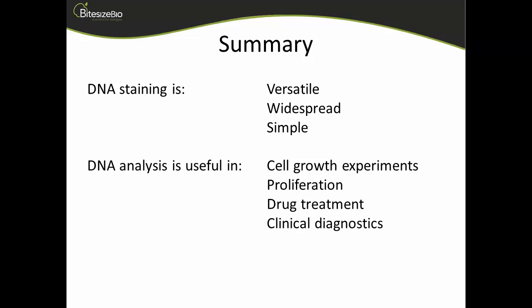You spoke about saturating concentrations of dyes. Do you find this is common to most cell types when they're fixed, or is there a lot of variation between different cell types? If you always stick to the same cell concentration when you're dealing with mammalian cells, there's not a lot of variability. But of course, stoichiometry depends not only on dye concentration, but cell concentration as well. So if you've done your titration and worked out that you saturate at a certain micrograms on 1 million cells per mil, and then you try and do 20 million cells per mil in your samples, yes, you may be out of that range. It always pays to try and keep the cell concentration constant.